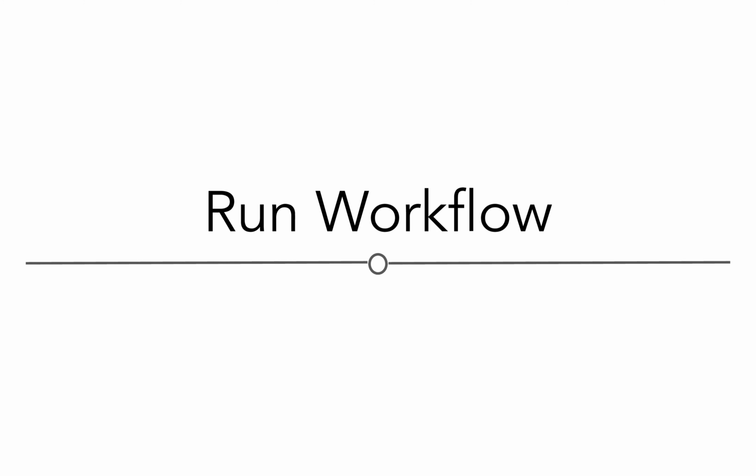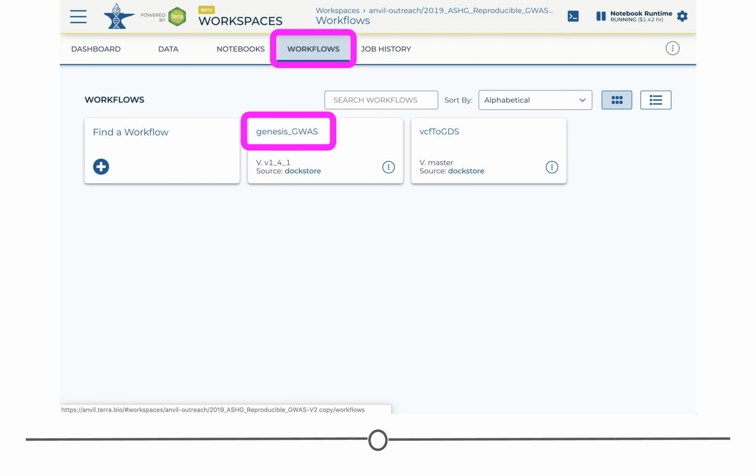Run workflow. Now, we will use this workspace to run a batch analysis workflow that identifies variants associated with a phenotype of interest. Click on the Workflows tab to show what workflows have already been imported into this workspace. We will use the Genesis GWAS workflow from DocStore, which can take advantage of cloud resources. In this example, analysis will be spread across 22 different compute nodes to search in parallel for associated variants.